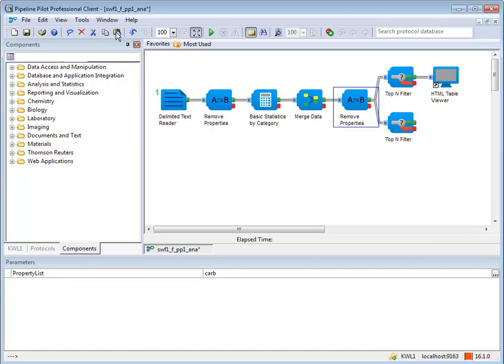As you have observed, numerous input pipes and output pipes are allowed to flow the data into and out of a single component. Connections can also be made by dragging from a fail or pass port of one component to the input port of a second component. Double-clicking a connection toggles between the pass and fail ports.